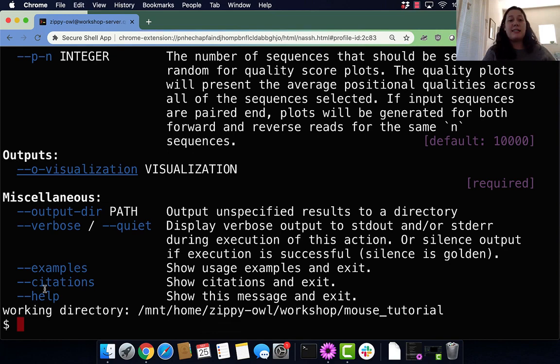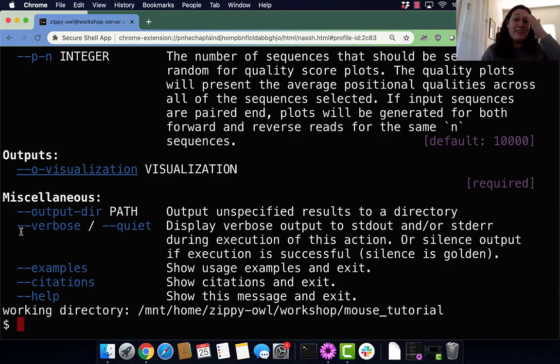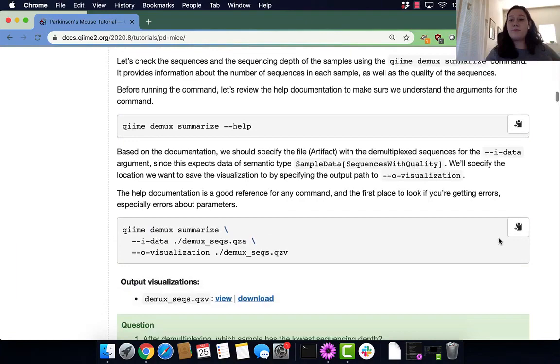Then there are examples, citations, and help for the command which we just ran. But now that we've taken a look into qiime demux summarize, let's actually run that command.